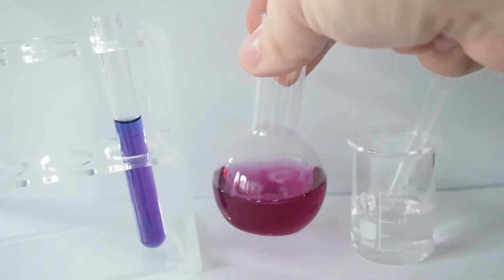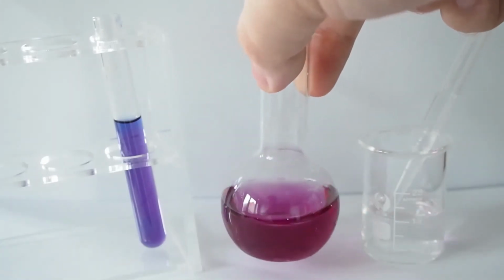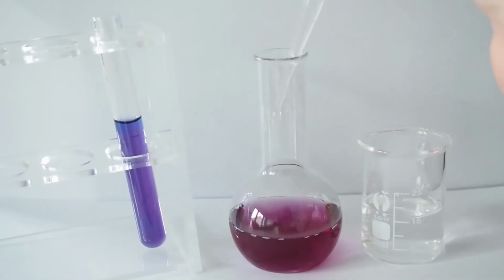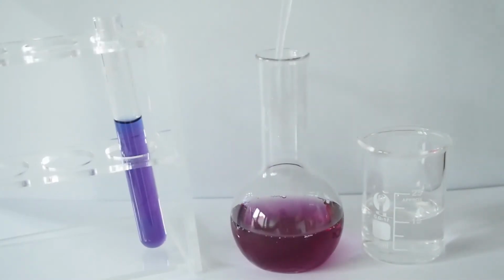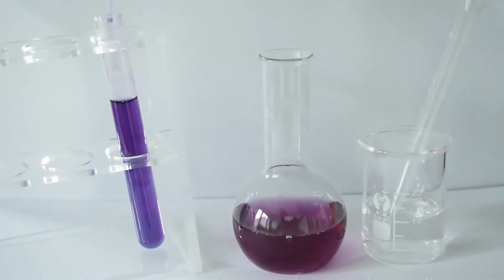And every time we mix, it's just to see if that colour is getting closer to our neutral solution colour next to us. Now I don't know why, but on the camera the neutral solution looks a lot bluer than it does in real life. It is a kind of blue, but it's a deep purpley sort of colour. So I'll stop the titration, and I've noticed it looks ever so slightly red still on screen.